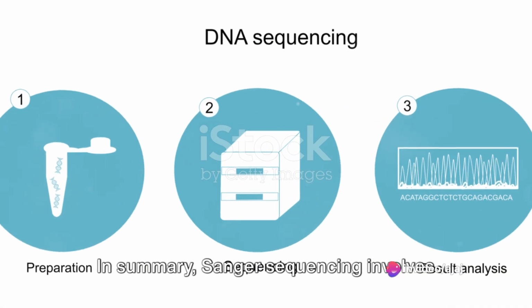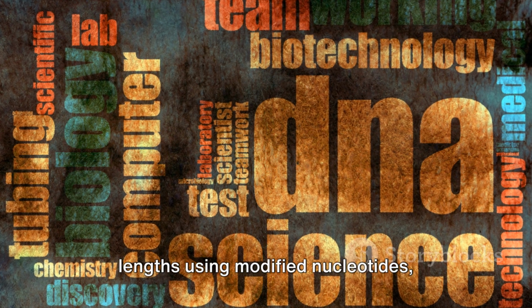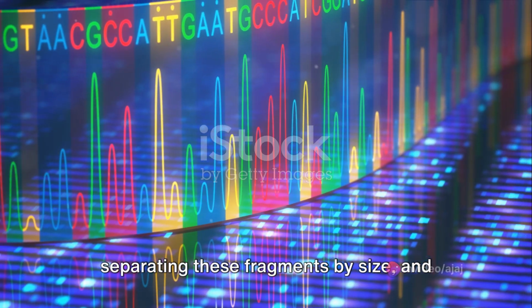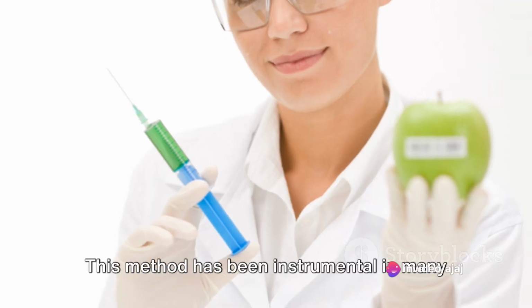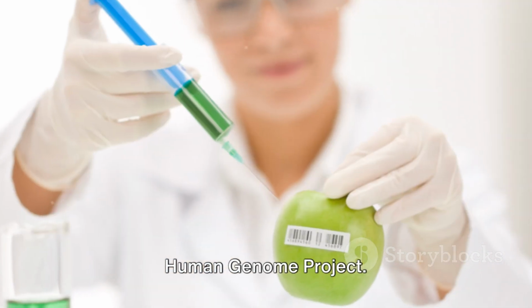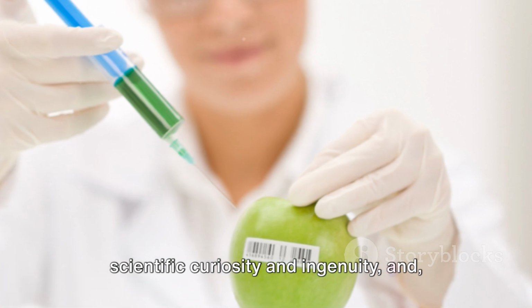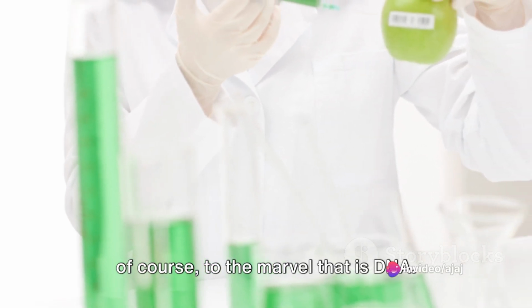In summary, Sanger sequencing involves creating fragments of DNA of different lengths using modified nucleotides, separating these fragments by size, and then reading off the sequence. This method has been instrumental in many scientific breakthroughs, including the Human Genome Project. It's a testament to the power of scientific curiosity and ingenuity, and of course, to the marvel that is DNA.